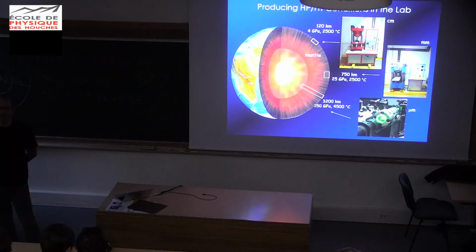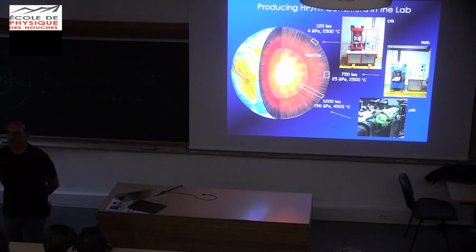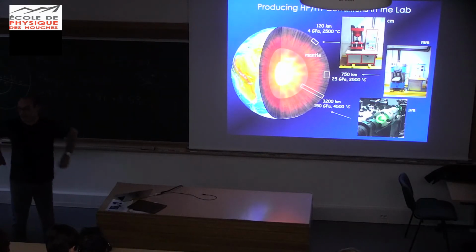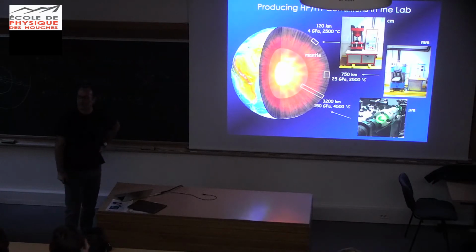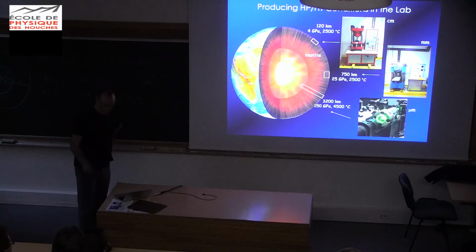I can't do 2 GPa in a diamond cell. It's too low. Okay. Yeah. And my pressure gauge has an intrinsic error of 2 GPa. But I see what you mean, I could answer your question at 25, and that should be doable, right? Between the multi-anvil and the... Oh, wait. So I'll show you. Okay, so you'll have an answer on, what's today? Tuesday, Wednesday, Thursday. I'll show you something. That's cool. Yeah. And the answer is yes.